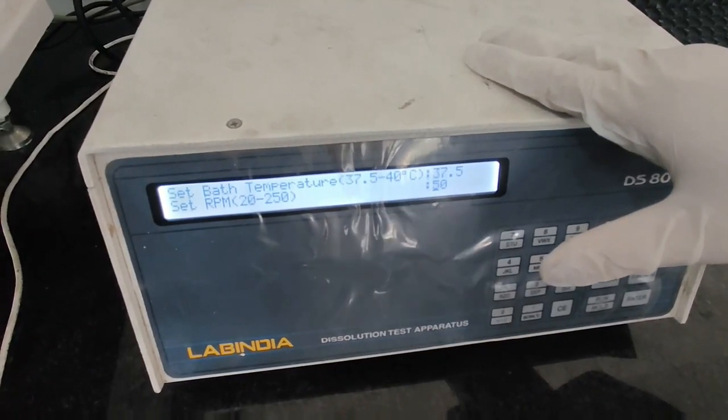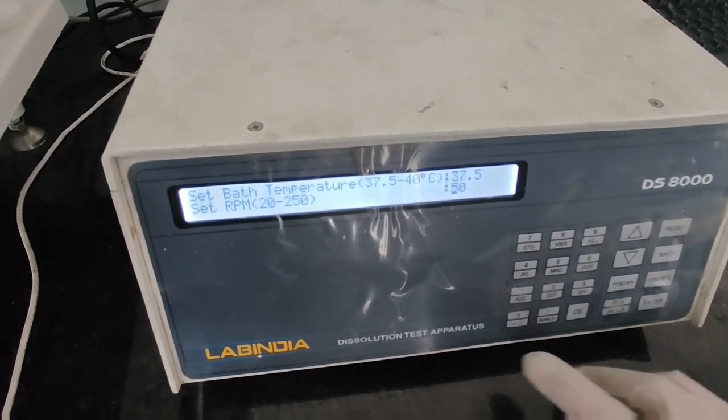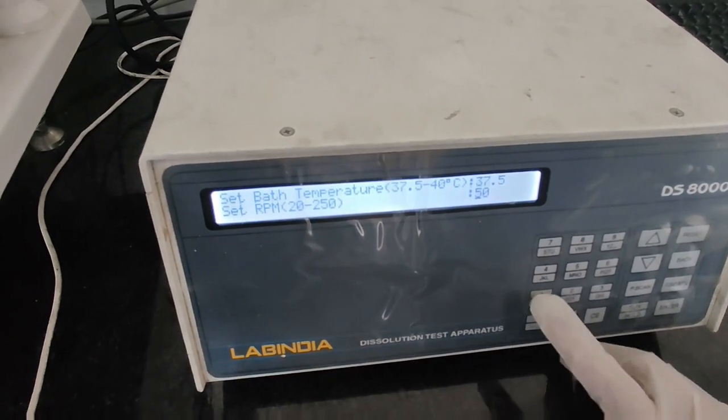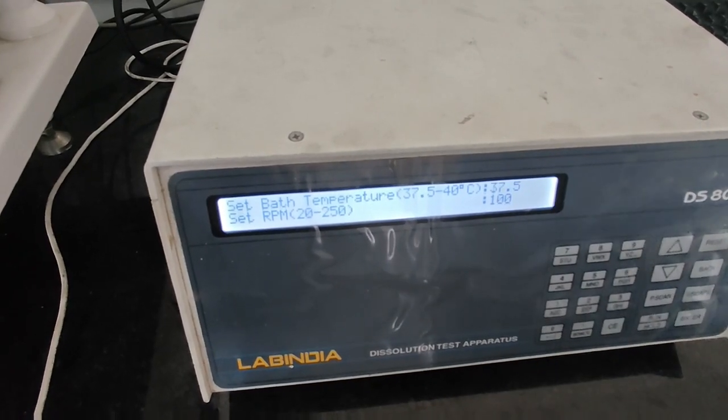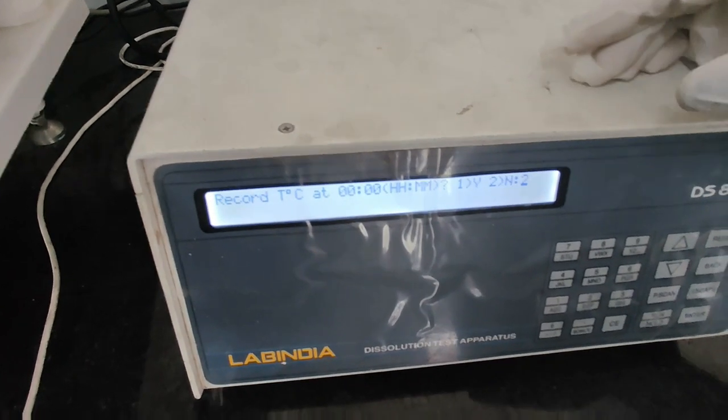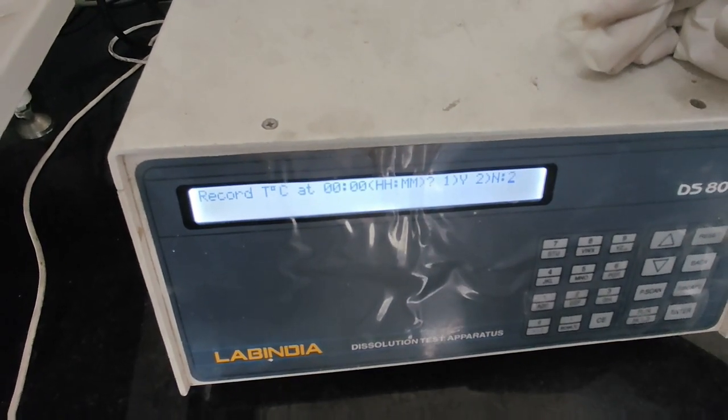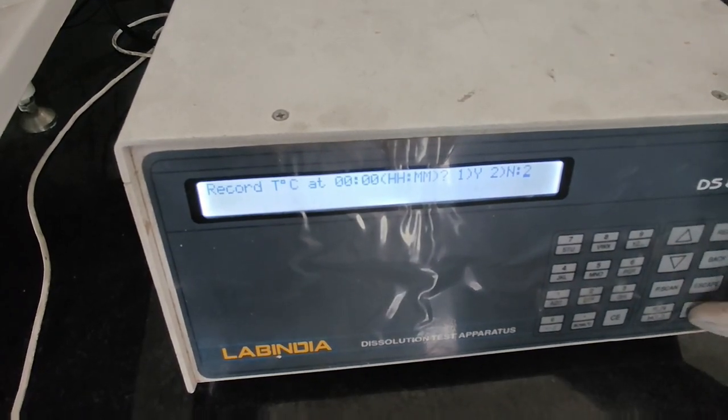Then RPM. I want to conduct the study at 50 RPM. It is already entered. If you want to conduct it at 100 RPM, for example, I will show you how to change. Like this. Then press enter. Then whether you want to record the temperature at 0 hour or minute, I don't want to record it, so I will press enter.